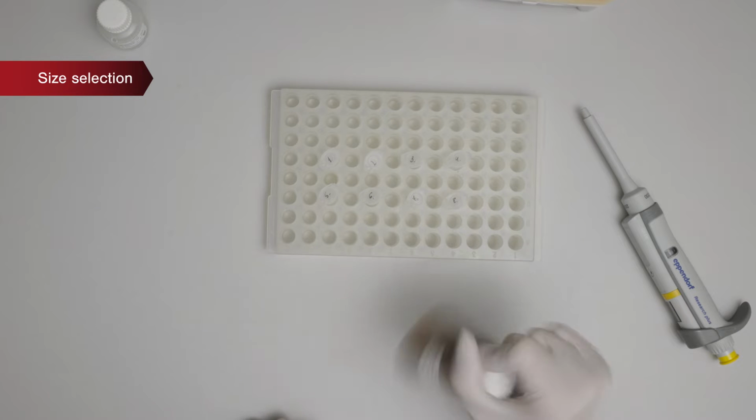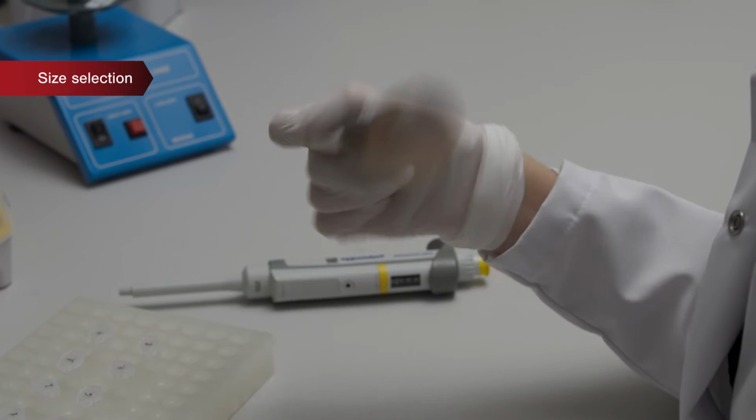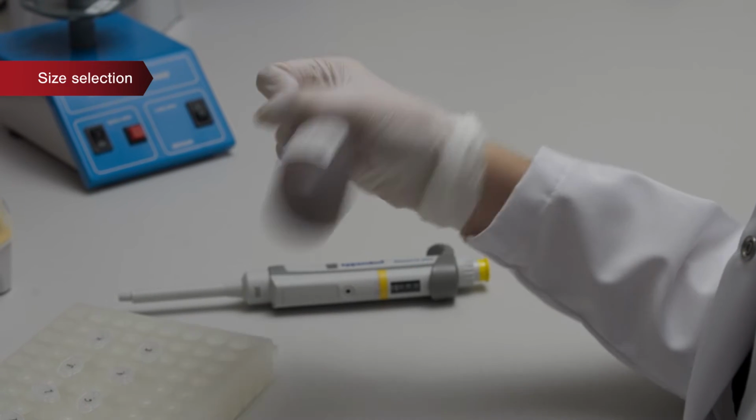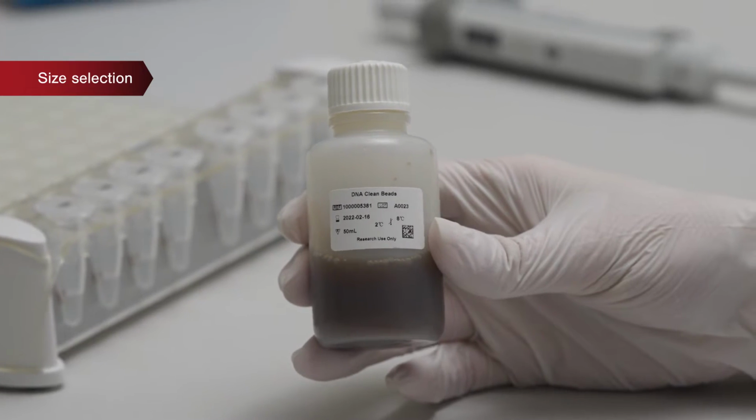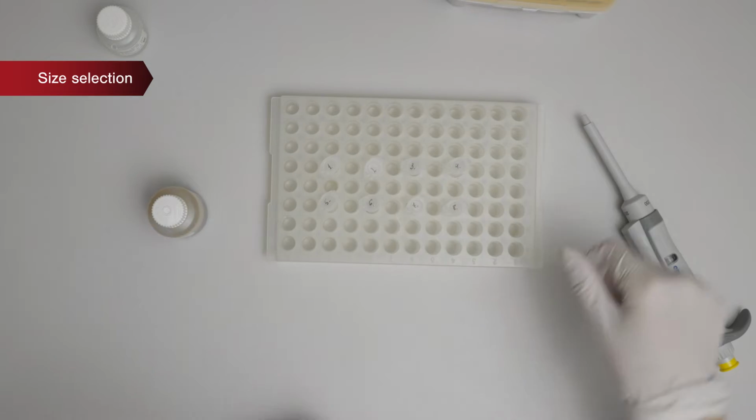In order to obtain the target fragment size of 420 base pairs, we add 60 microliters of magnetic beads to the 100 microliters of the DNA sample and mix by pipetting at least 10 times.